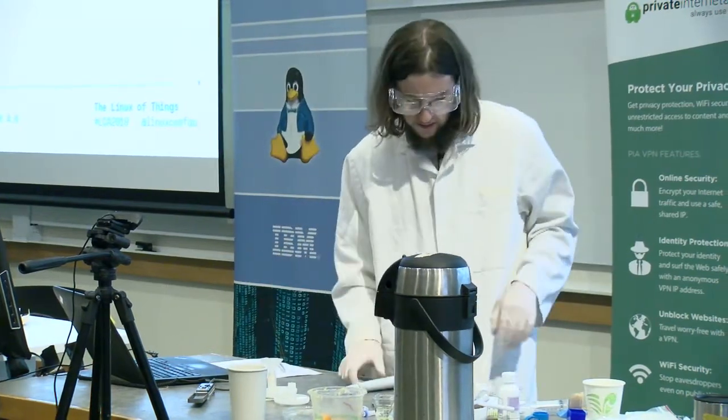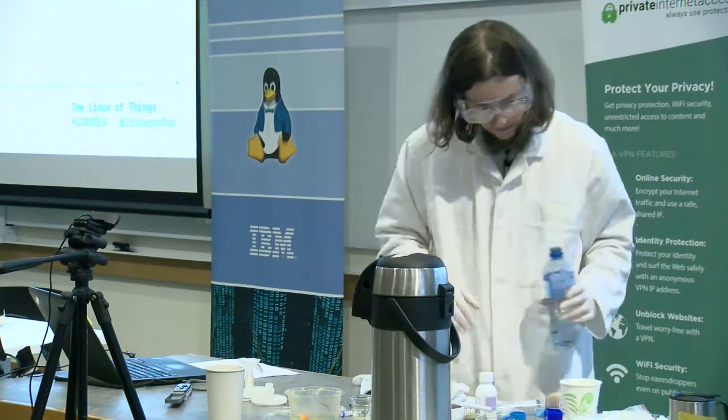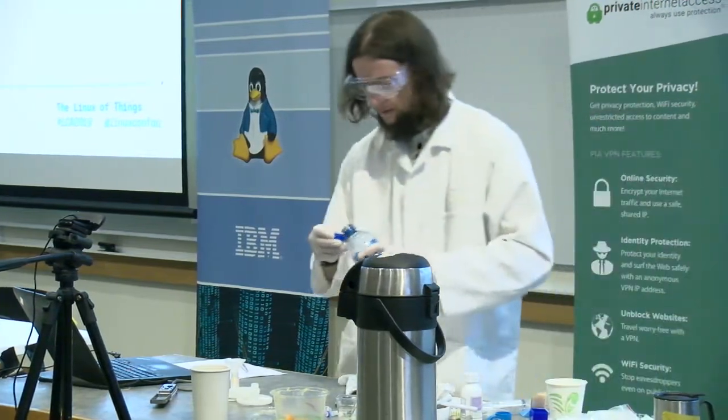Now, to this sample, I need to add a little bit of water. Where's the lid?